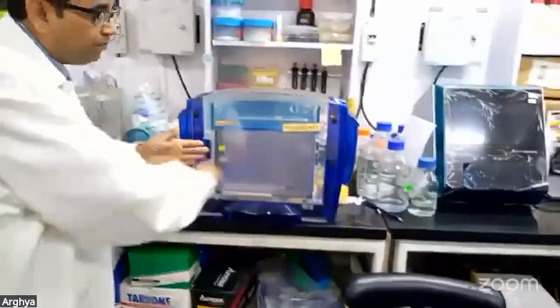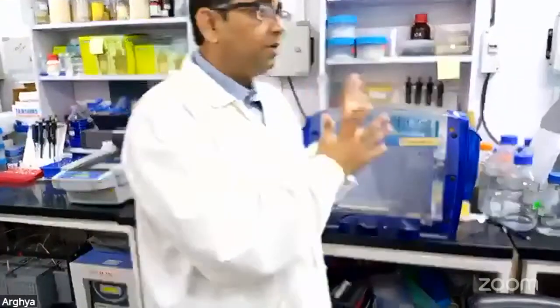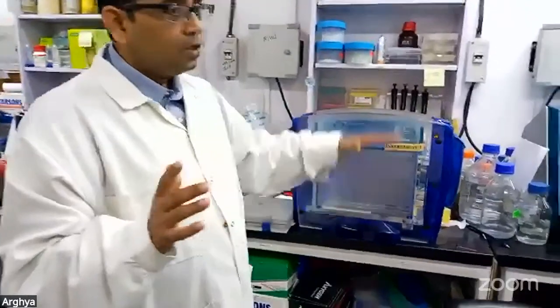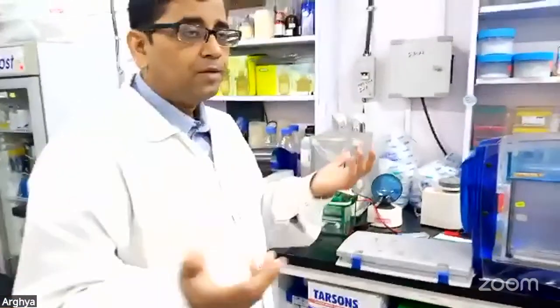Once you start the run, you can follow the run progression, see where the dye fronts are, and it will take several hours to run. This can take even overnight time, maybe 12 hours, 14 hours, or longer to separate these complex protein mixtures. A 7 centimeter gel can take maybe just 3 to 4 hours, but the large gel can take a good 10 to 12 hours. But again, the goal was to look at complex proteome mixture separation, and in this case we are also looking at differential proteomics, with 3 control and 3 disease samples running and separating at the same time.